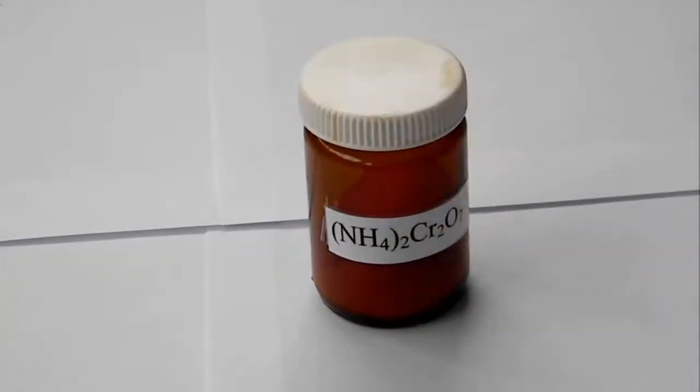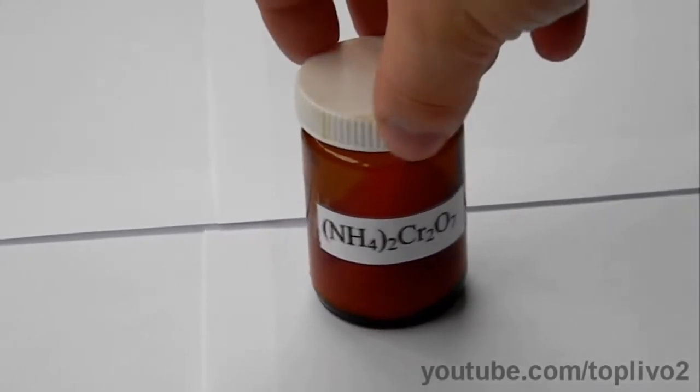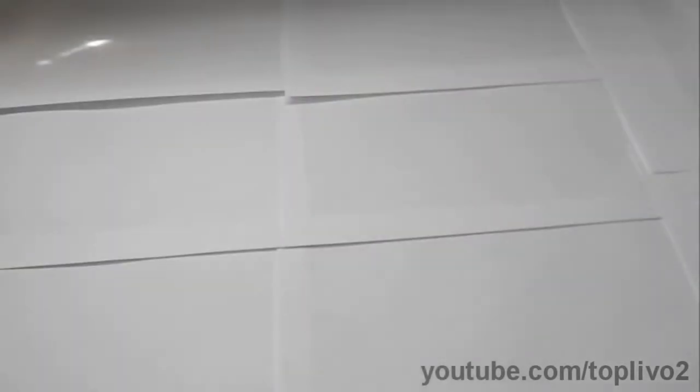Hello everyone! Today we will conduct a reaction with chromium oxide 3. Chromium oxide will serve as a catalyst. We will get the chromium oxide from the decomposition reaction of ammonium dichromate.